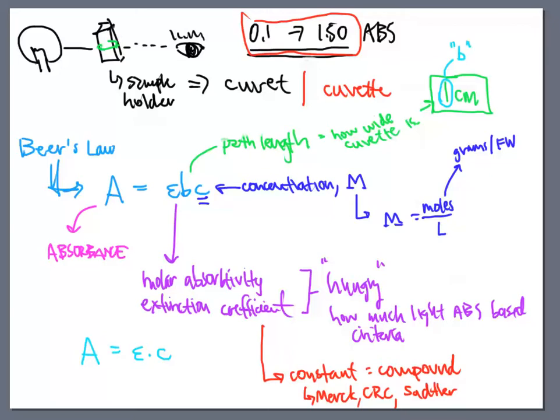In these reference books, they are going to be listed with 1 or 2 variables. Some of the reference books will list the molar absorptivity with the E, the epsilon, just like it's written here in the equation. However, some of the textbooks will list the molar absorptivity as an A sub M. Both of those are the same thing.